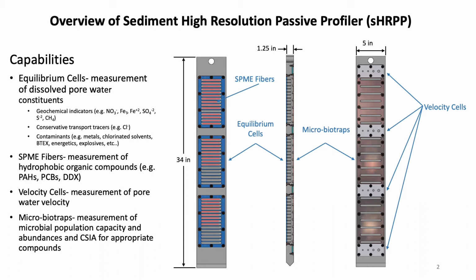all of which devices have been used to monitor. The equilibrium cells, as will be explained in the next coming slides, basically operate by equilibrating with the pore water and are diffusional samplers.